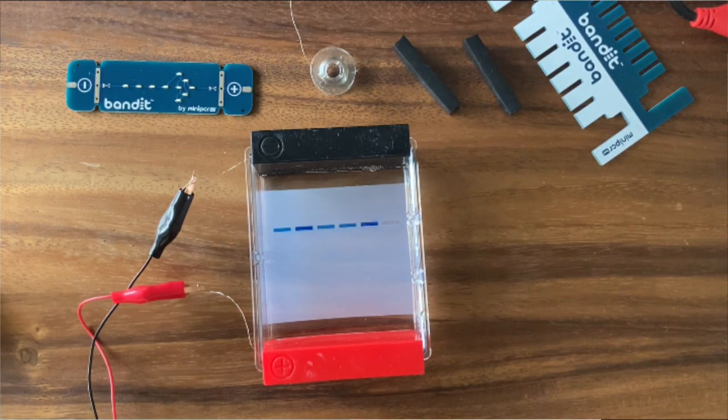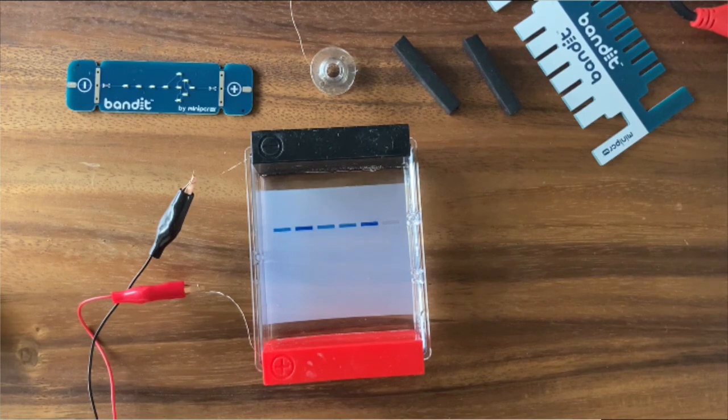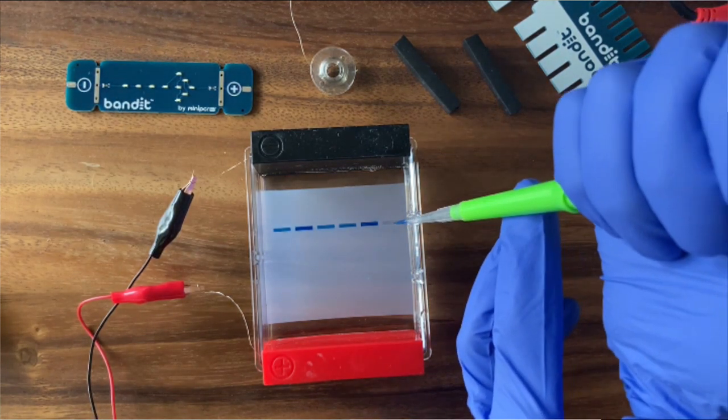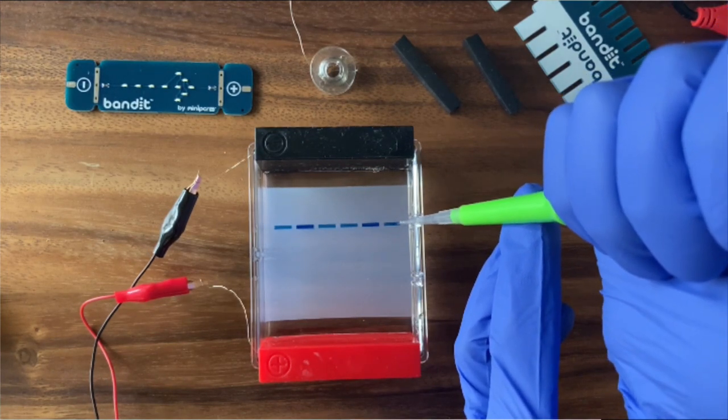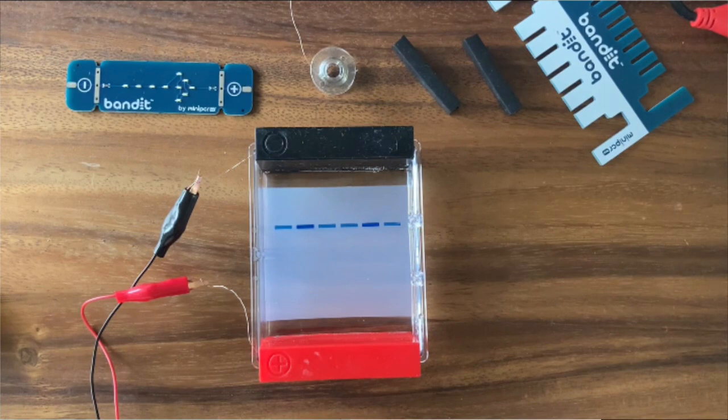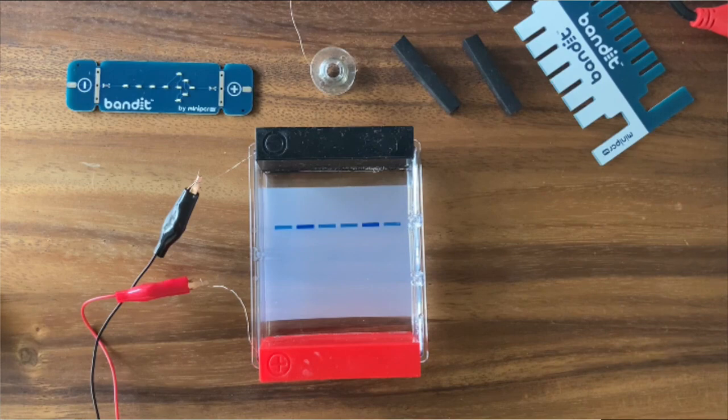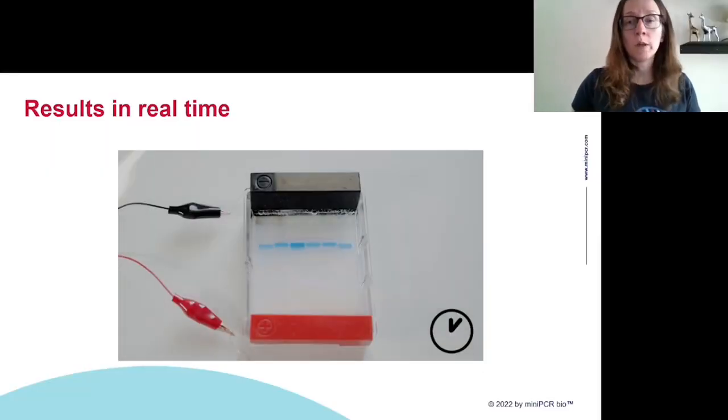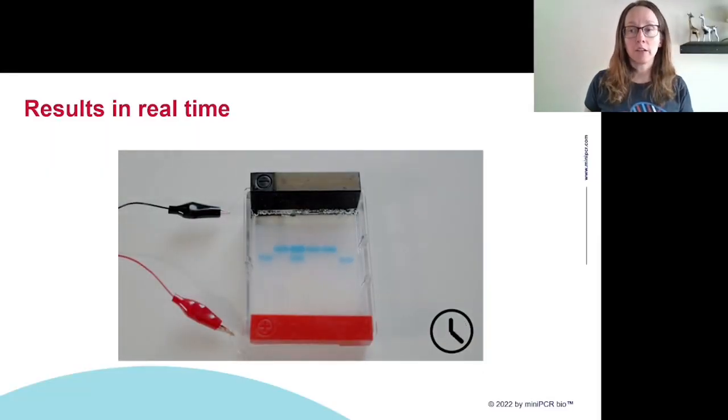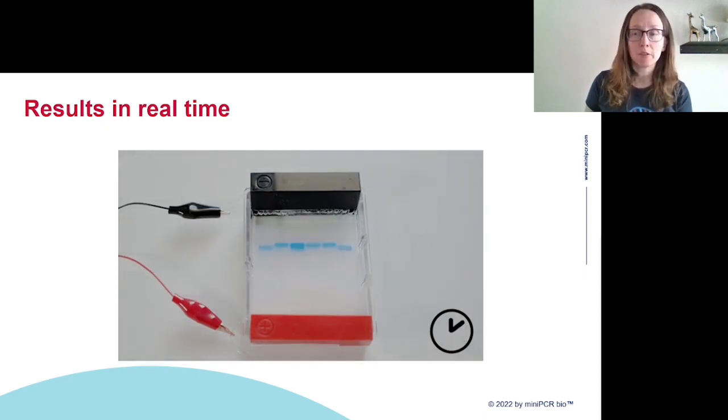I'm just finishing up with my last sample here, loading it in the sixth well. You can see those nice blue rectangles are telling me I've loaded it as I intended to. I didn't inadvertently inject the sample into the side or the bottom of the gel. It looks good. It looks like we're ready to run.